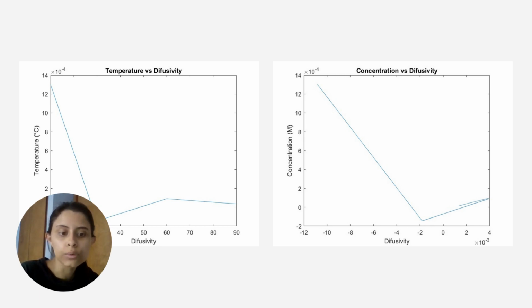Then there comes a point where the diffusivity reaches its limit and now the repellent added will be more than water and the concentration will rise. There is a point in the experiment where, while the diffusivity grows, the concentration returns, and it can be rooted in experimental errors. It is possible that at that temperature, the selected sample went beyond the 1.7 centimeter mark, and in return, the concentration calculated did not match the natural behavior of the diffusivity.